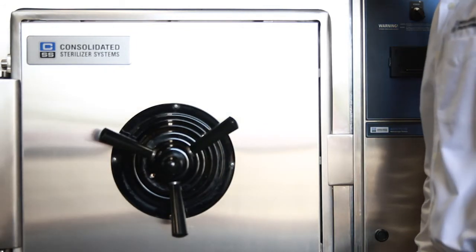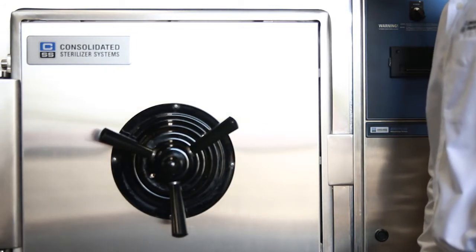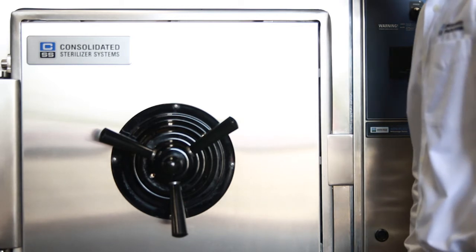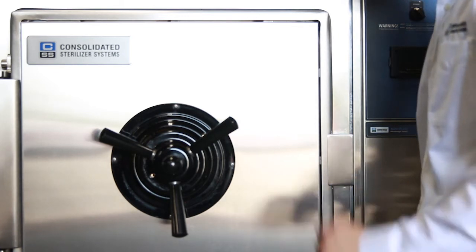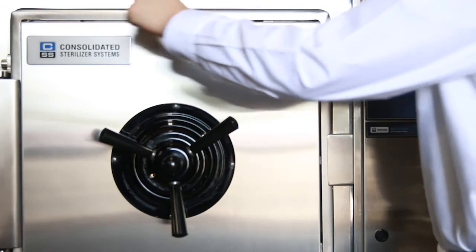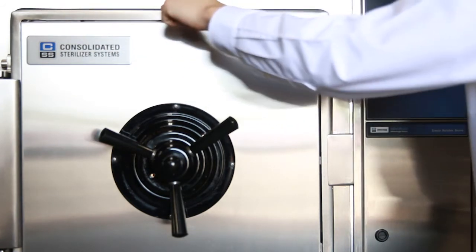The third way of determining whether or not the door gasket needs to be replaced is if you see any leaking steam in between the door and the end ring anywhere along the top, sides or bottom.